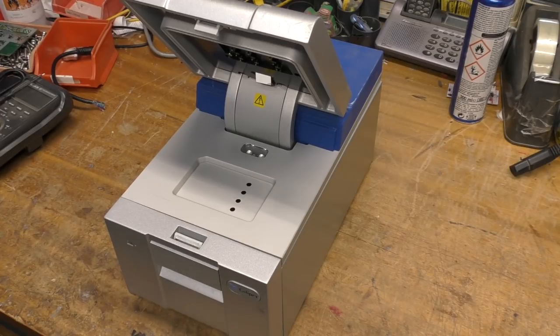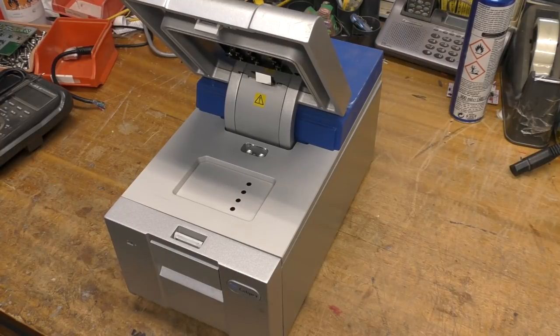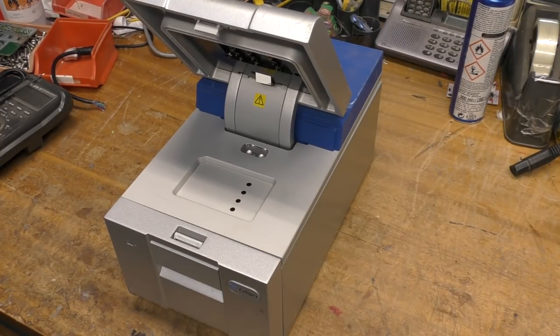I saw one, and this is the photodiode. Can't see any obvious part number markings. There's a number on the bottom which looks like a serial number, and I even did an image search and I can't find anything even in the same package, so it's clearly something vaguely exotic. It might be something that's optimised for specific wavelengths, and it's obviously quite a large area, so it's probably quite an expensive part.